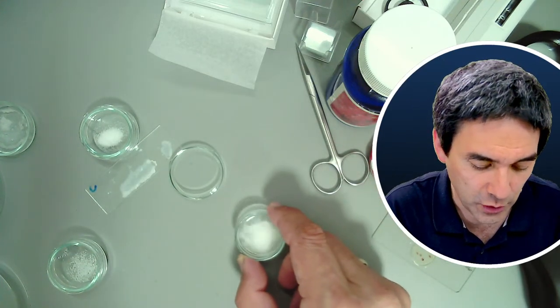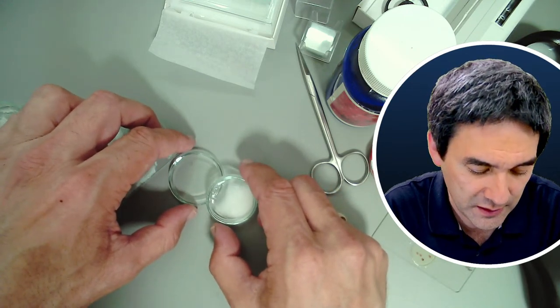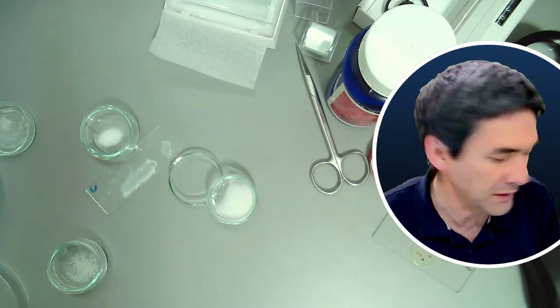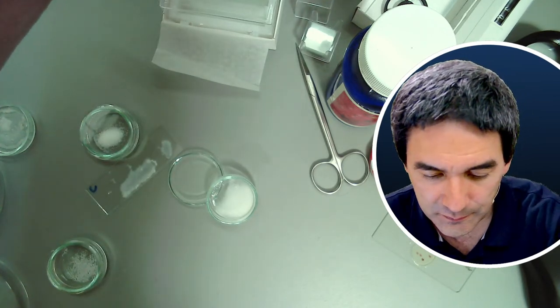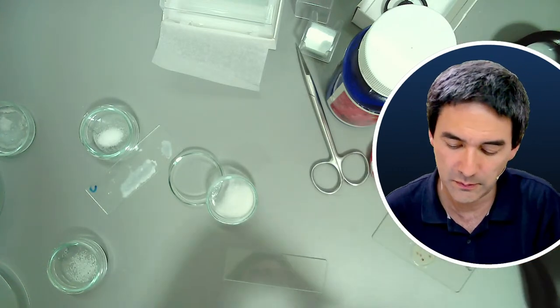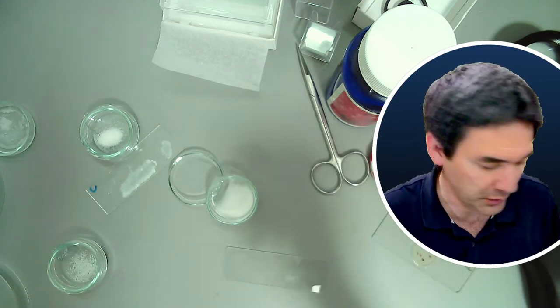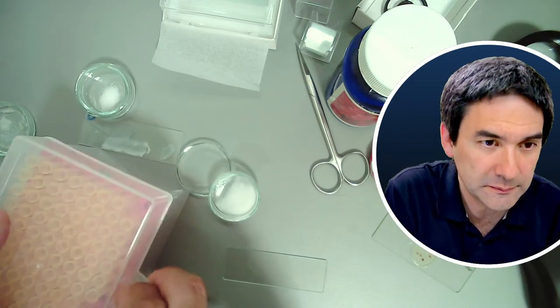I think it's now dissolved, and what I do now is tilt it a little bit so that the cellulose can settle down to the ground, and I will now take a slide. I will add a little bit of the alcohol and caffeine solution on top here. I'm going to use a fresh pipette.